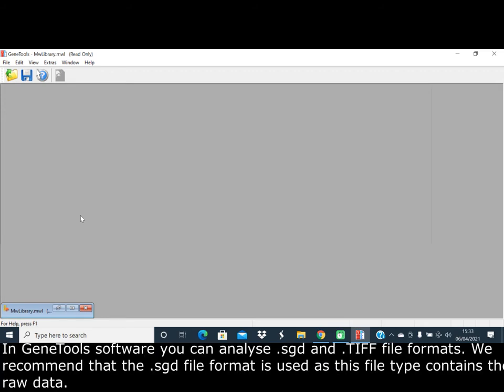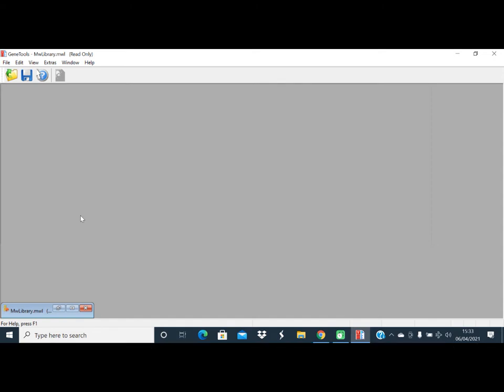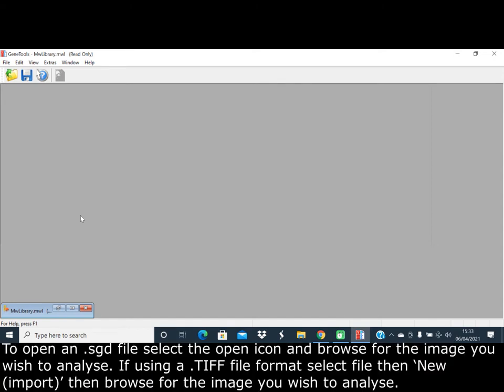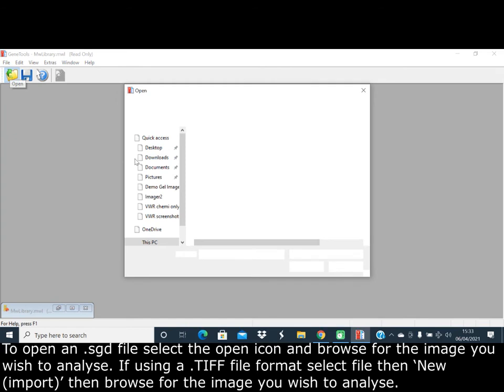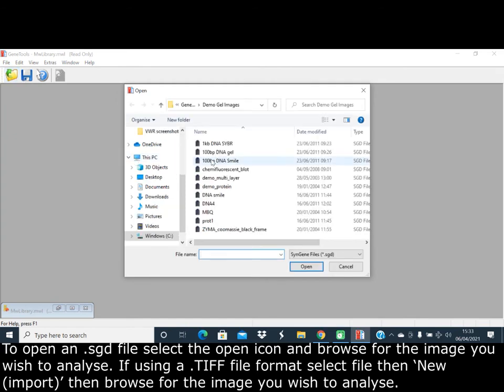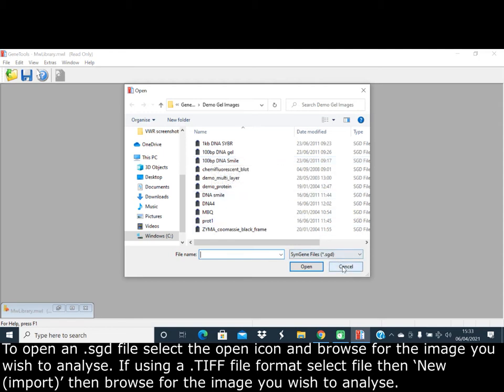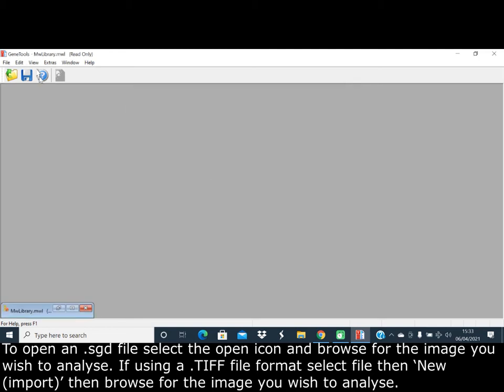In GeneTools software, you can analyze SGD and TIFF file formats. We recommend the SGD file format as it contains the raw data. To open an SGD file, select the open icon and browse for the image you wish to analyze.